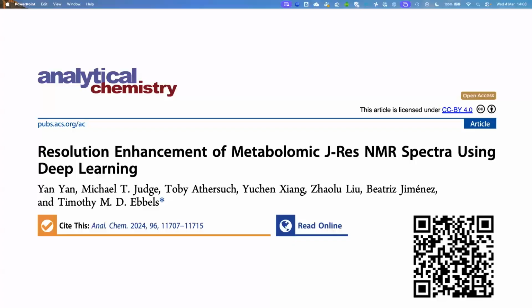In the paper, we show some examples with and without the symmetric loss, where you can see changes in the symmetry of the data produced. But as an NMR person, you might think it's adding a lot, whereas I think most of the improvement is from the basic ESRGAN network, probably. We thought we were adding something nice, and we were, but it wasn't rocket science.